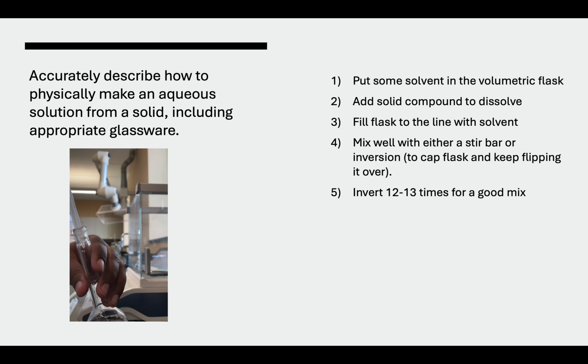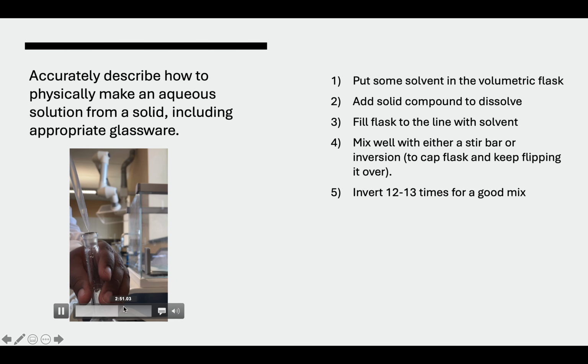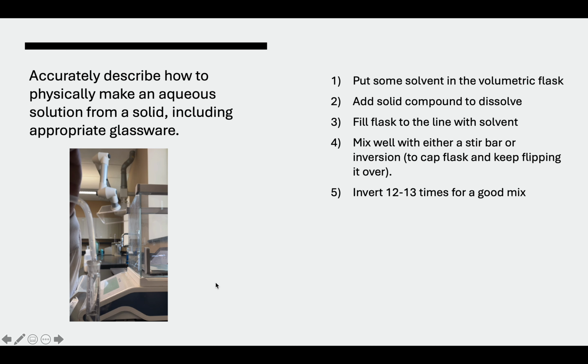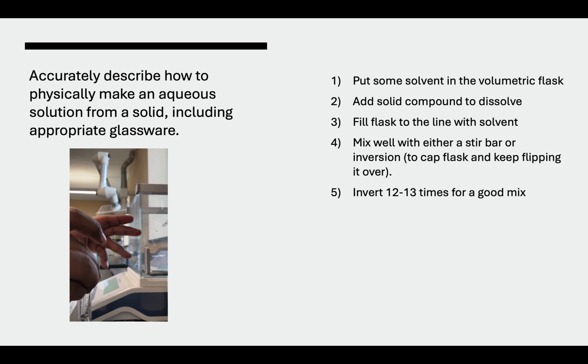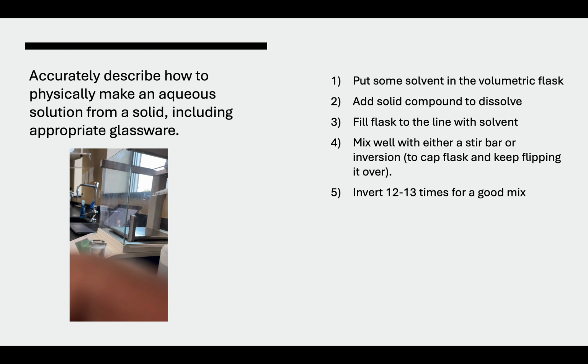And now you want to fill up the water to the line. And the meniscus is now at the line.